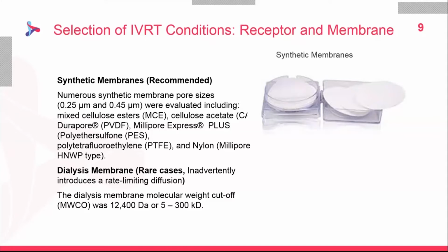Also, control standards should be evaluated without membranes and kept under the same storage conditions. Further, analyze the concentration of standard solution with and without membranes and calculate the recovery. A ±5% acceptance criterion will validate the membrane.